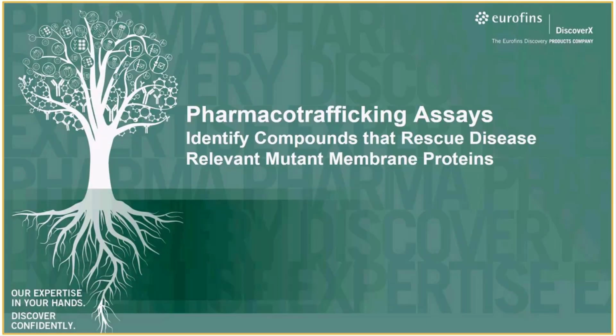Hi, this video goes over the unique cell-based assays called pharmacotrafficking assays for membrane proteins like GPCRs and ion channels and other things like transporters. It allows you to identify small molecule compounds that rescue disease-relevant mutant membrane proteins.